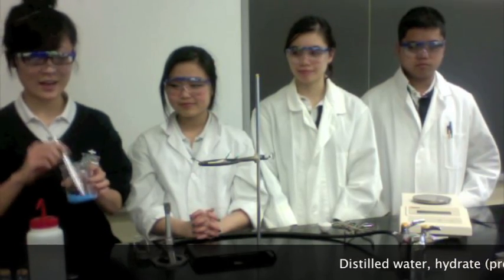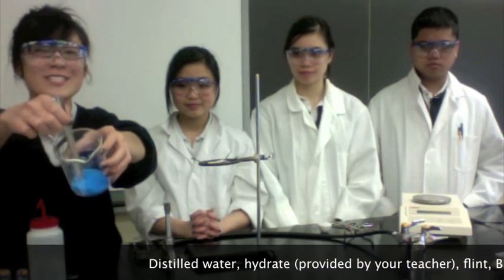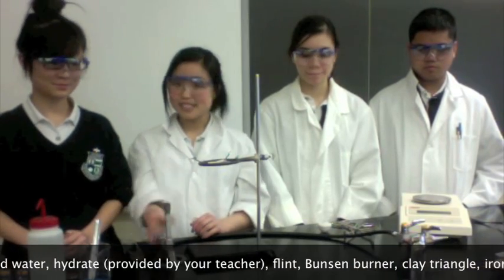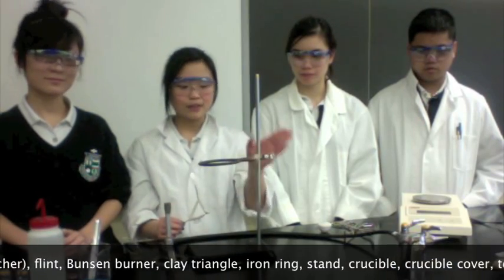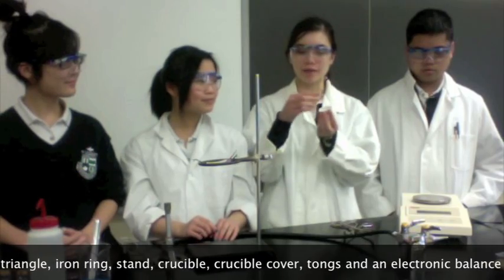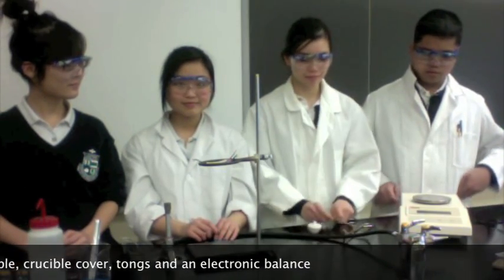For this experiment, we're going to need distilled water, and a hydrate given to you by your teacher in the form of blue crystals. You also need your flint, your Bunsen burner, a clay triangle to put your crucible on, and an iron ring with your stand. You will also need a crucible and a cover, crucible tongs, and finally an electronic balance.